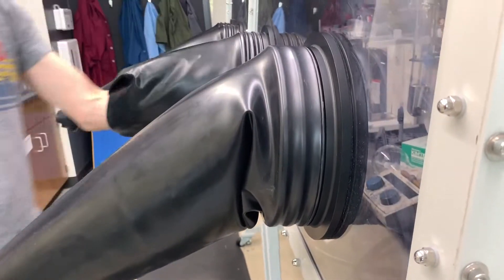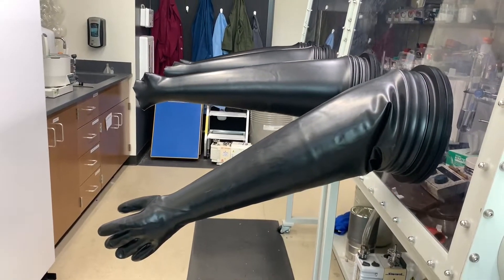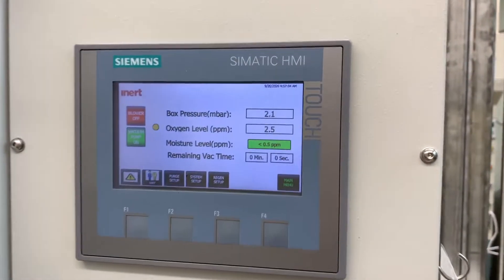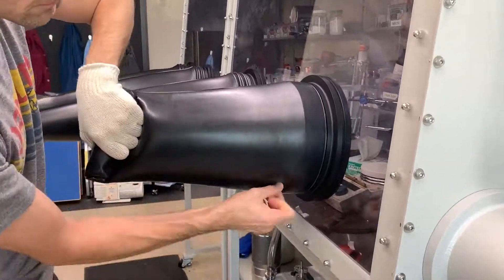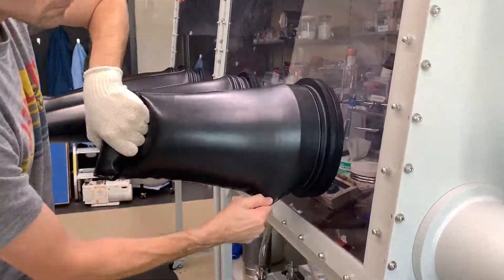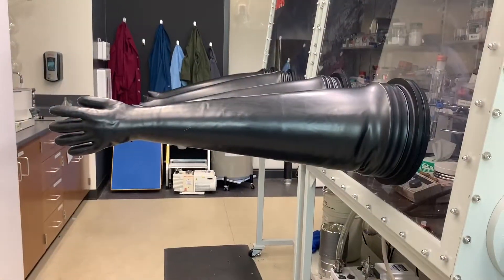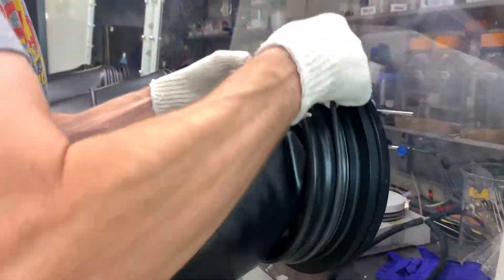Why did we go through all this trouble? Why didn't we just open it all the way up? Even though we squeezed as much air out of it as possible, that wasn't all of the bad air. If we took the porthole cover off at this stage, the oxygen level in the box would likely skyrocket into the hundreds if not thousands of parts per million. So the glove is inflated but then separated, and we'll start the process of squeezing out the bad air all over again. We'll push the air out and refill with nitrogen from inside at least three times, but preferably five cycles just to be safe. This process of removing oxygen and humidity just isn't as thorough as the antechamber can be.